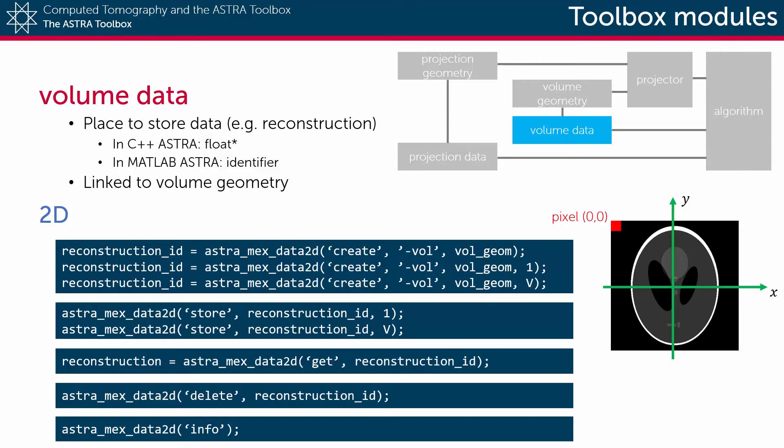To transfer the data from the Astra memory back into the MATLAB environment, for example after a reconstruction algorithm has finished, you use get and the data identifier.